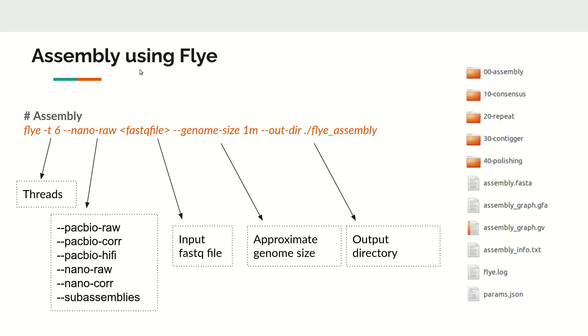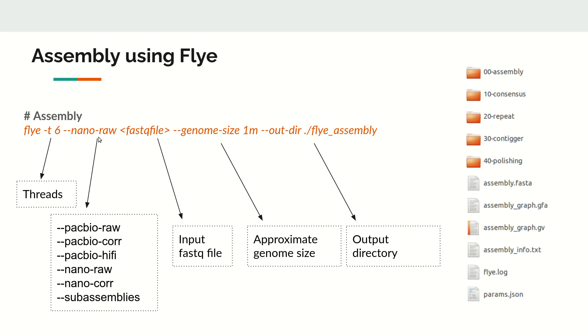Now we will see the command. Assembly using Flye is very simple. You type the path to the Flye command, then specify how many threads you want. In this example, we use six threads with hyphen t. Then you specify the input data type.